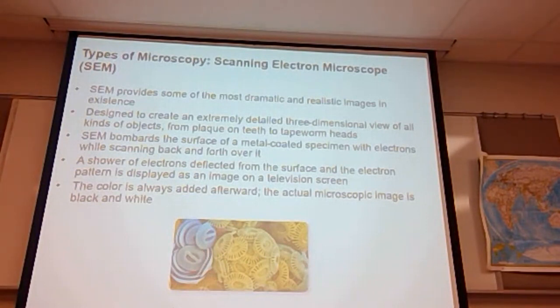But again, most of these are connected to a computer, and you can add these colors later. You can go in and tell the computer everything that looks like this structure right here, color it yellow, and it will then color all of those things yellow. Then you tell the computer everything that looks like this or this, color them blue, and everything gets colored blue. These colors are added afterwards.